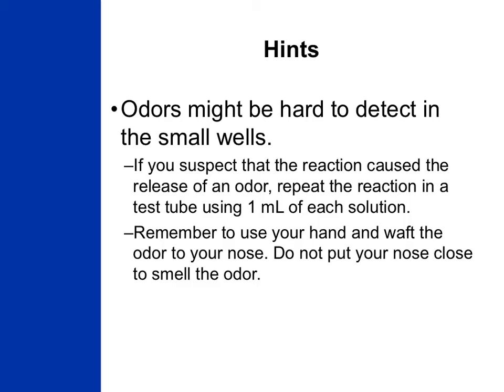You don't want to do them all at once because more than one may give off an odor. If you've got multiple odors being given off from a single reaction at one time, it's hard to tell which one of the wells in your well plate that odor is coming from. So it's important, again, that you mix the solutions together one at a time.